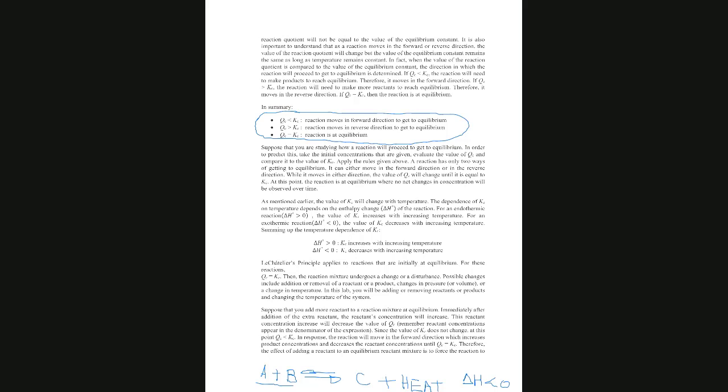So we have here an exothermic reaction. When we add heat, let's say we add more heat, I want to disturb it. Let's say we are resting on a couch and somebody comes and disturbs us, wakes us up. We don't want to leave the system at equilibrium. We heat the system, we put it in a water bath and raise the temperature.